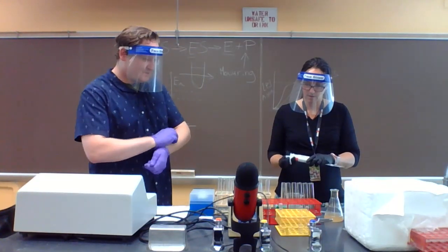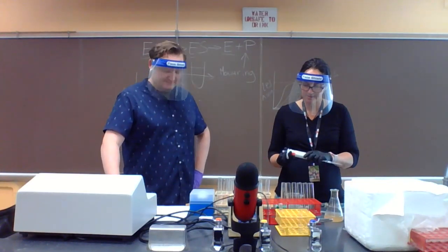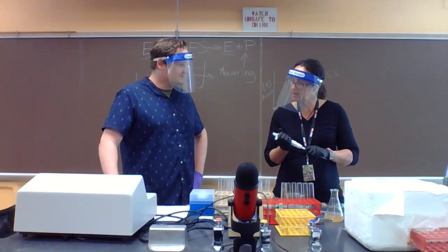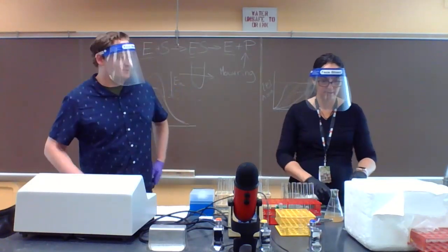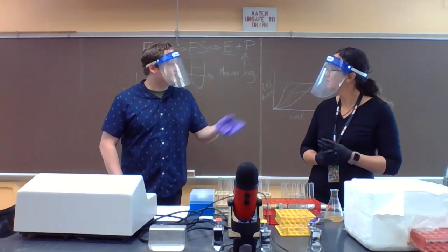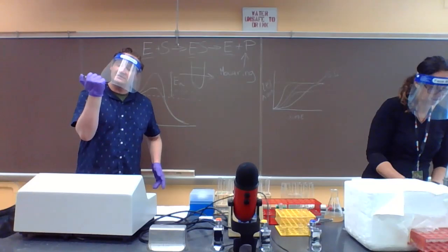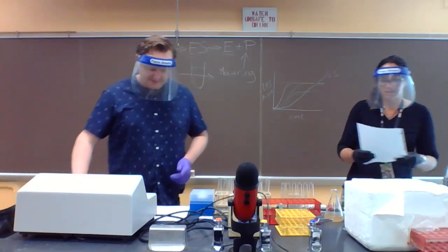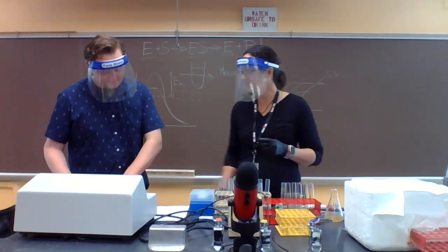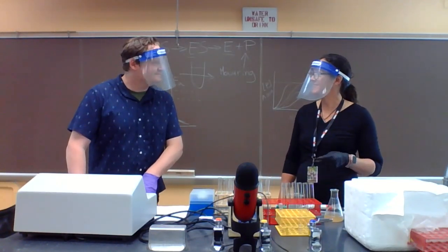Very good. Okay, so I have this set at 500 for the catechol. Should we go ahead and measure tube 1? We might as well. And can I use that data sheet to enter in our information as we go? Stupendous. So just like in the carbohydrate lab, Jonathan's going to record the percent transmittance, and then you guys are going to work out the absorbance using that formula.